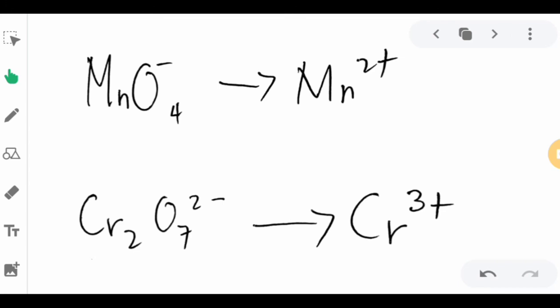Okay, so like acid-base titrations, redox titrations normally require an indicator as well that clearly changes color. In the presence of large amounts of reducing agent, the color of the indicator is characteristic of its reduced form. The indicator assumes the color of its oxidized form when it's present in an oxidizing medium. At or near the equivalence point, a sharp change of the indicator's color will occur.